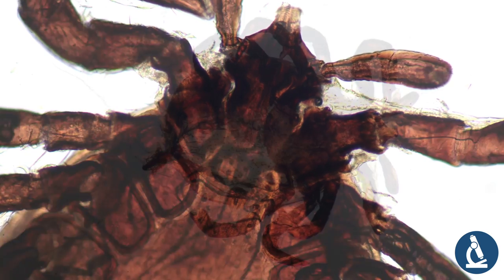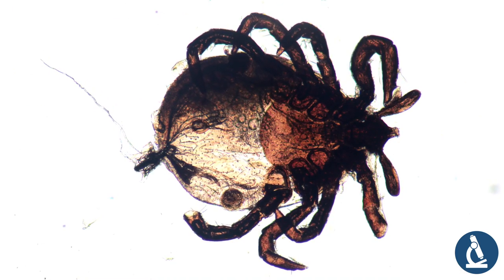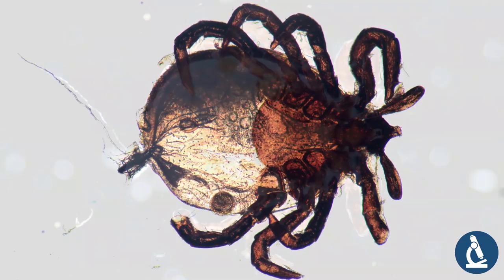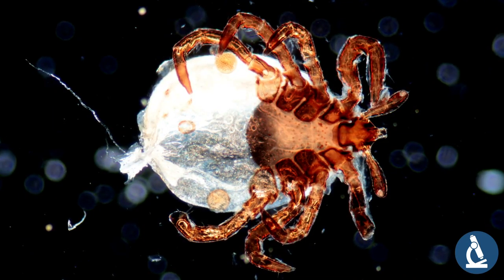This is in bright field, a picture, and this as well. I think it does not quite look as nice as in dark field. It's a little bit difficult to see the structures. And that's again in dark field.